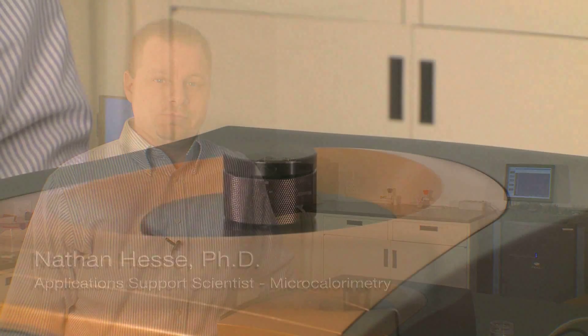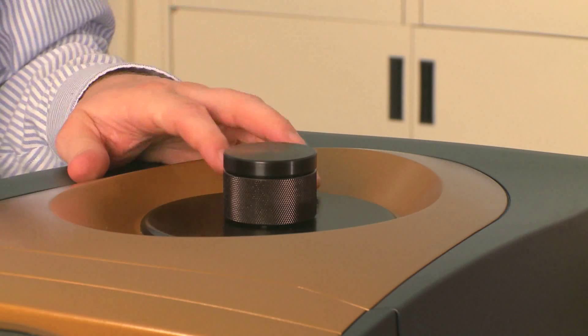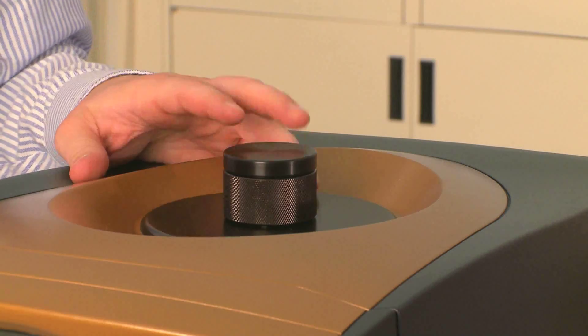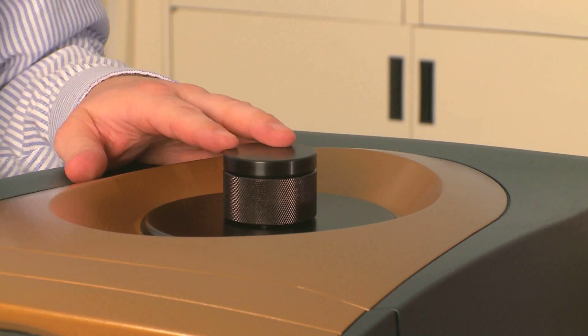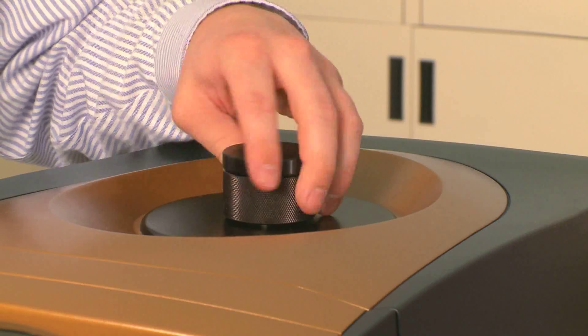In this TA Tech Tip we'll be loading the NanoDSC. The first thing you need to do before loading a sample is to make sure you depressurize the system through the software. Once depressurized, you can open up the pressure cap and load your sample.